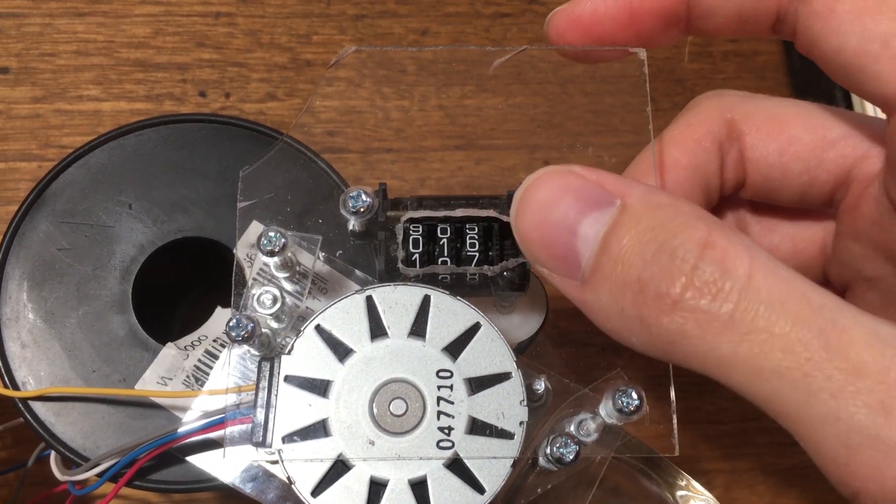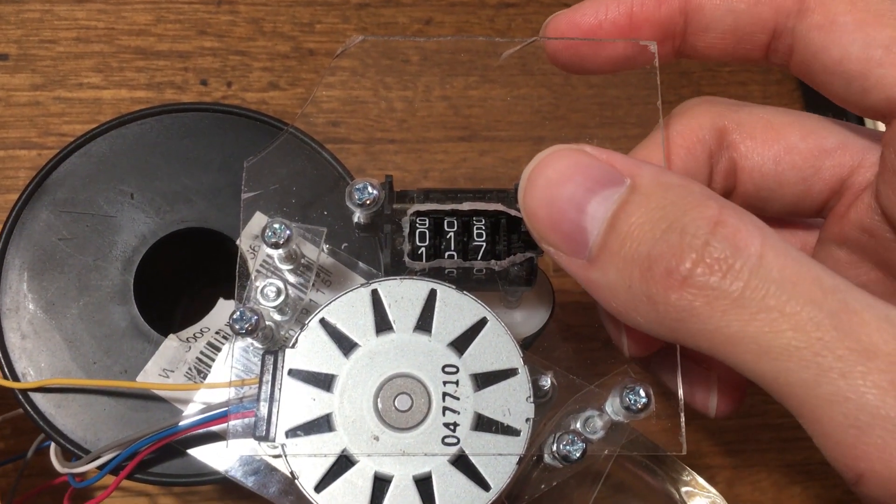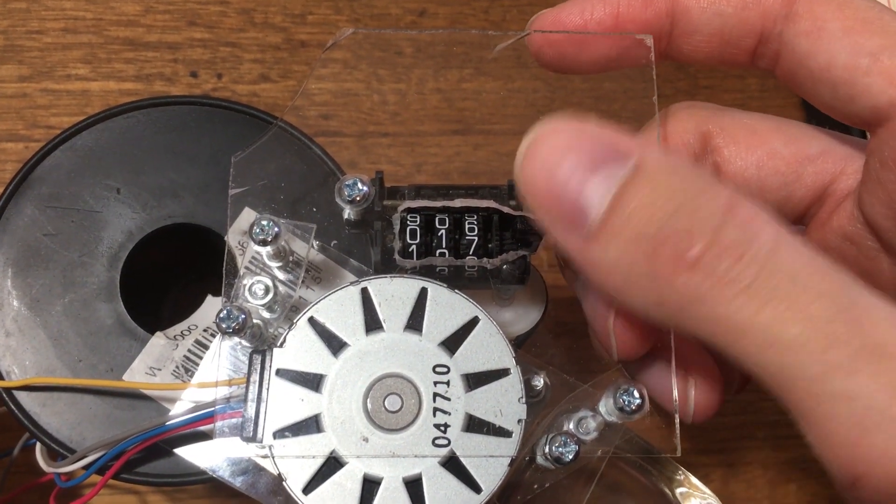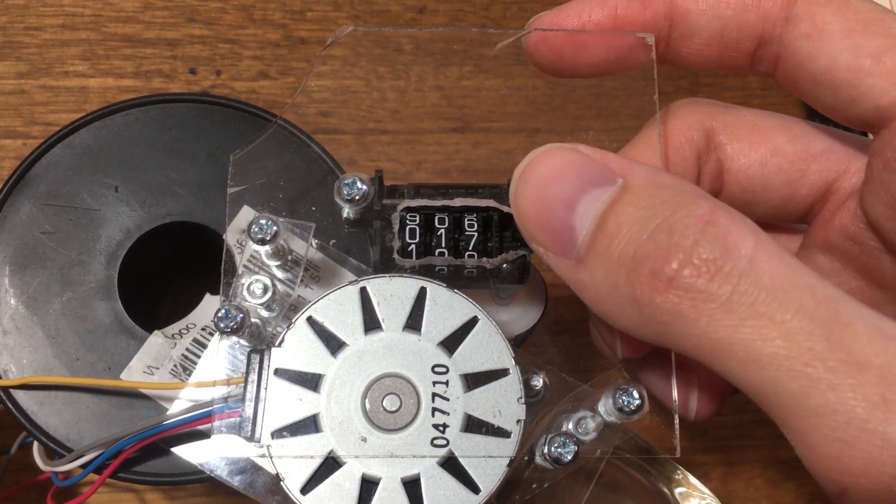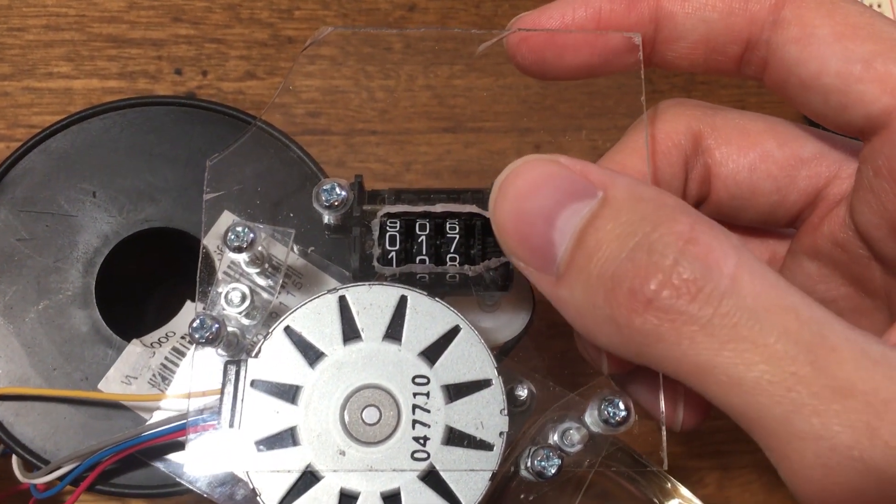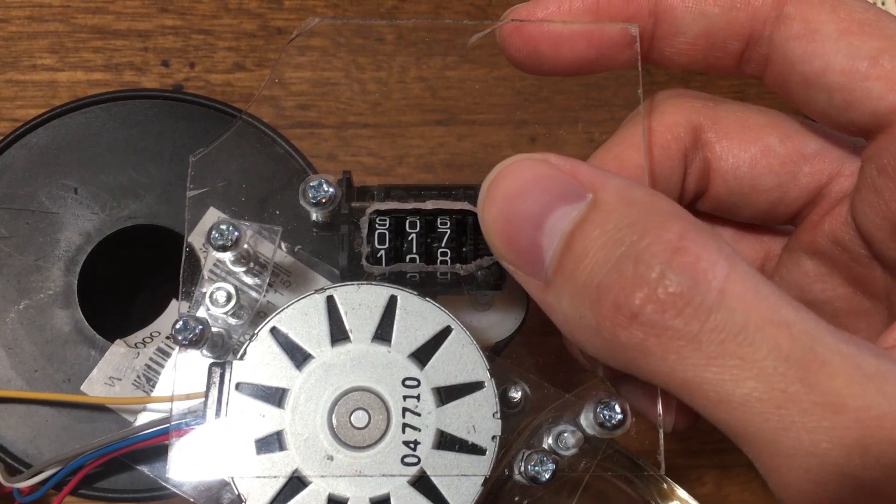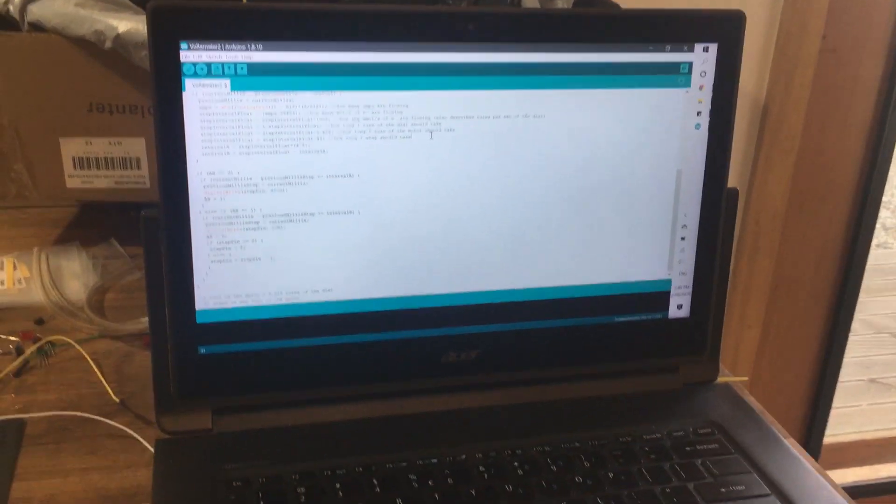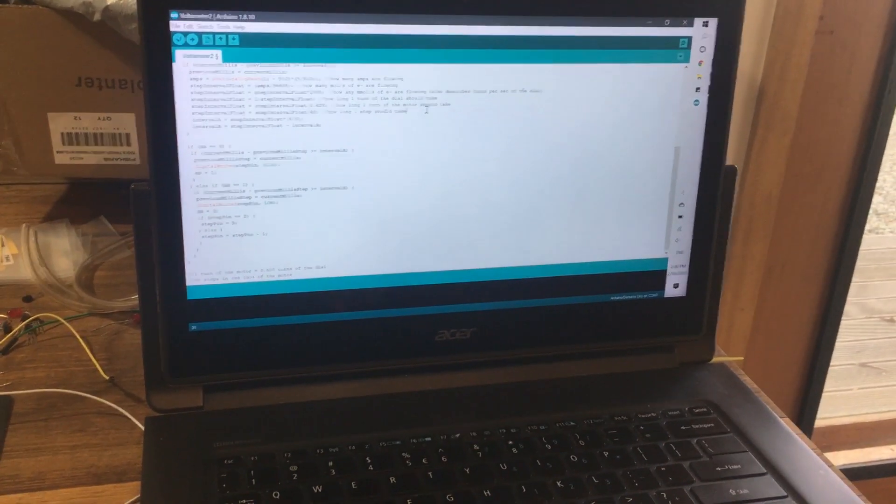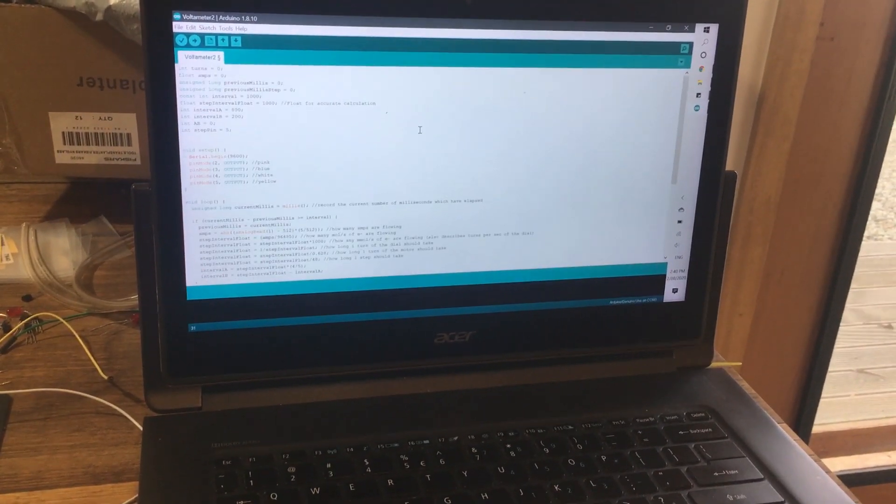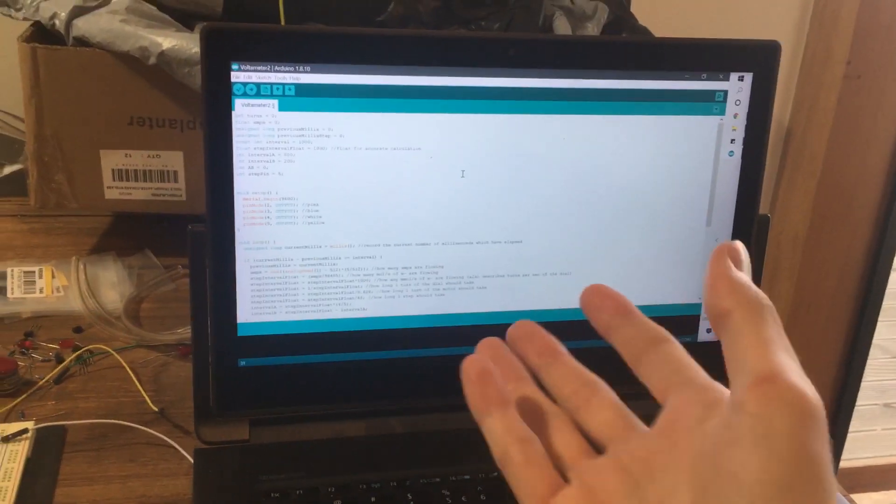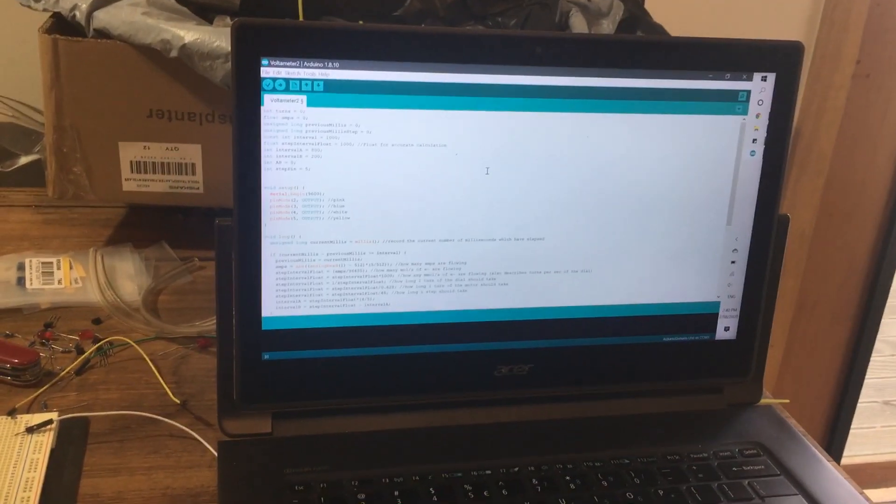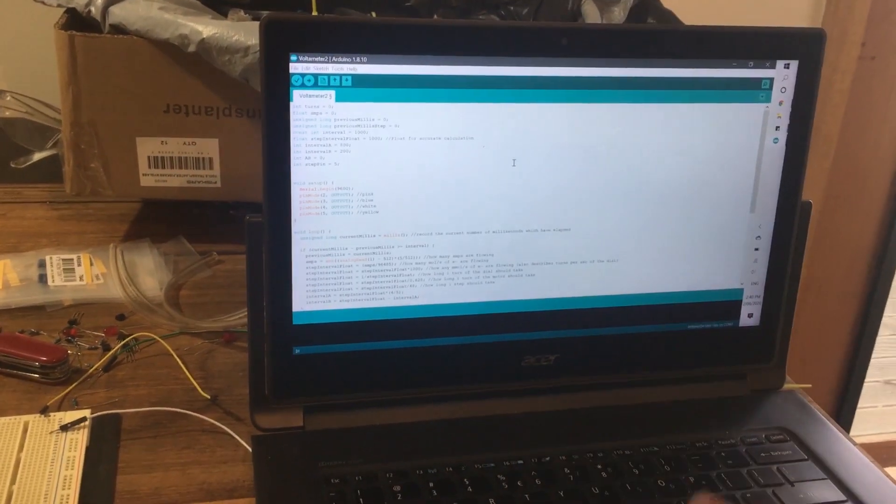We can also reset the device with this button right here while it's in motion, which is pretty cool. I won't go into too much detail as to how I've done my Arduino code here, which I've just finished.